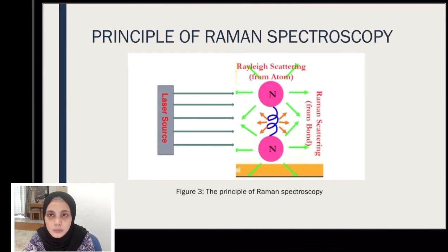Okay, for Raman spectroscopy, a laser source is used in the Raman scattering because it is a very intense beam of nearly monochromatic light that can interact with sample molecules. Next, Rayleigh scattering will occur when incident electromagnetic radiation interacts with an oscillating dipole in a molecule, which re-radiates at the same frequency. Raman scattering will occur when monochromatic light is scattered by a molecule and the scattered light has been weakly modulated by the characteristic frequencies of the molecule.